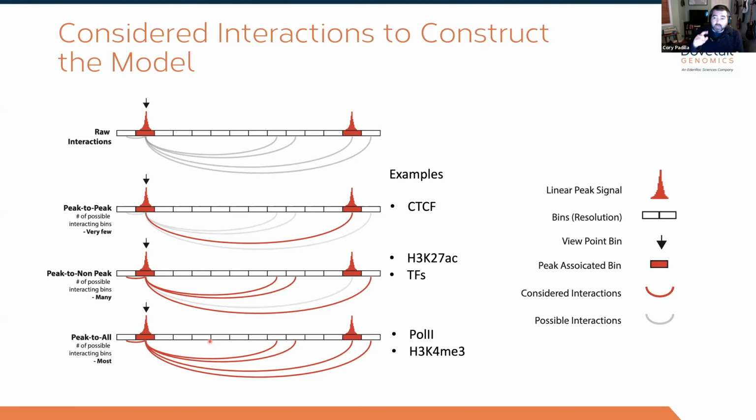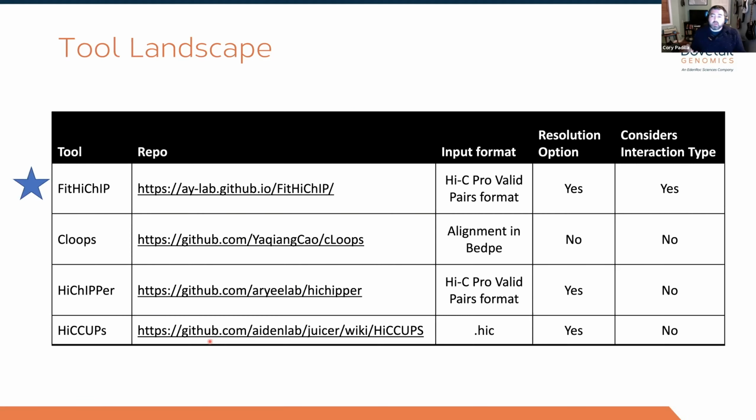So now that we know what contact arcs are, and we know what primary and secondary peaks are, and we know how we call a significant interaction, let's go about doing that. There are a number of ways that you could go about this. You could do bespoke analyses if you want to. There are other prepackaged tools that will do this for us.